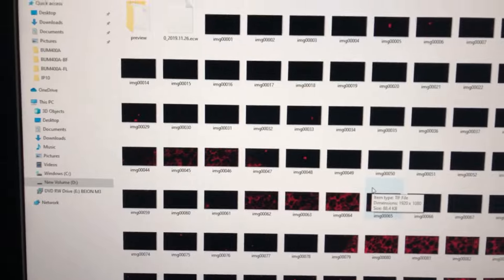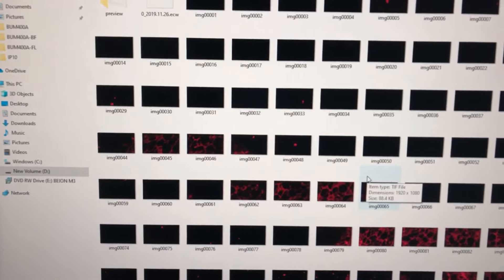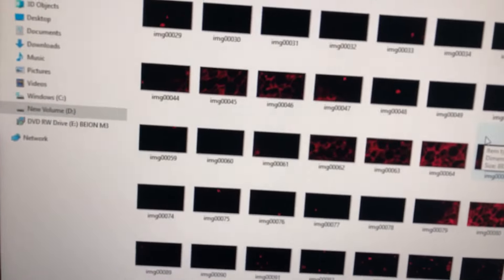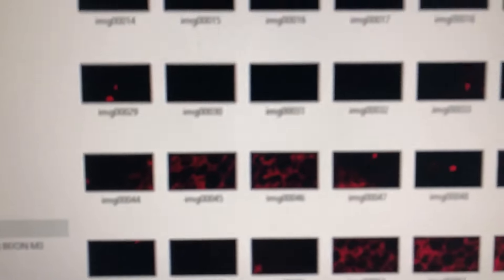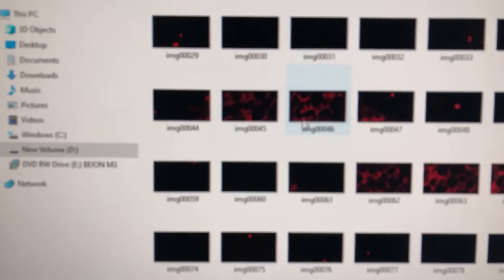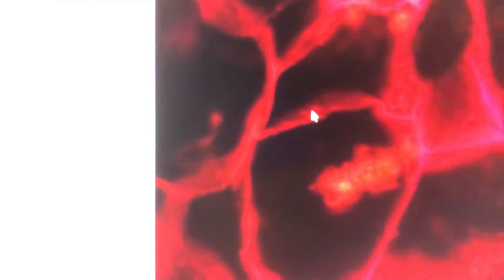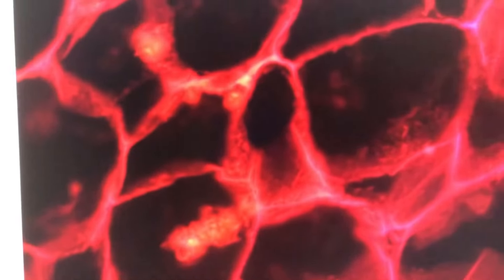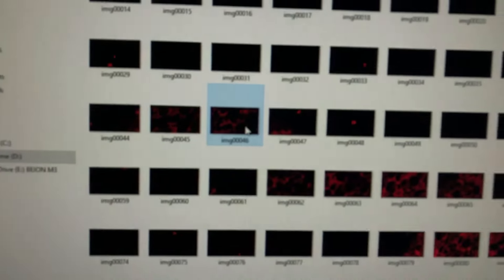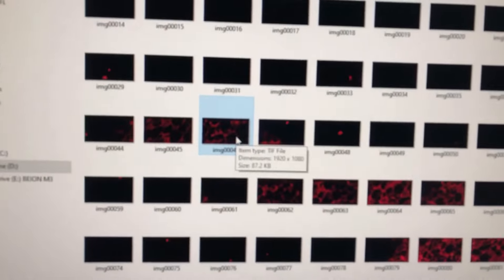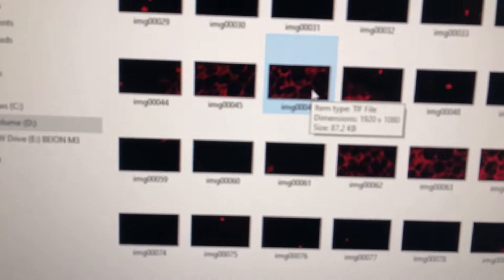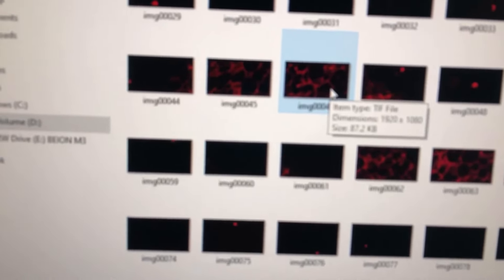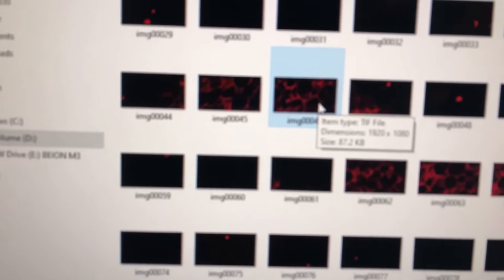We also have direct access to the raw images. You can see every single image and look at each one individually. As you can see, the image resolution is 1920 by 1080 and it is a TIFF file.